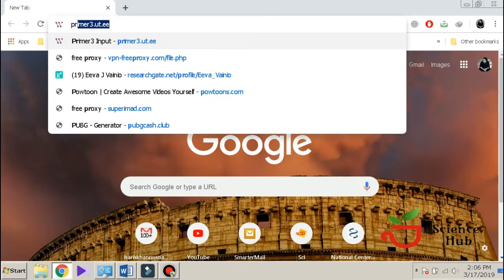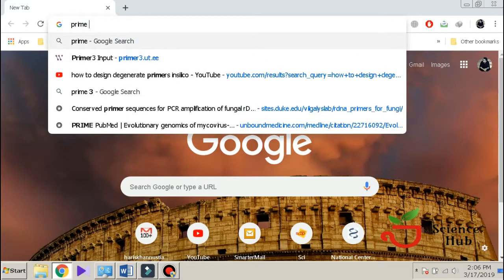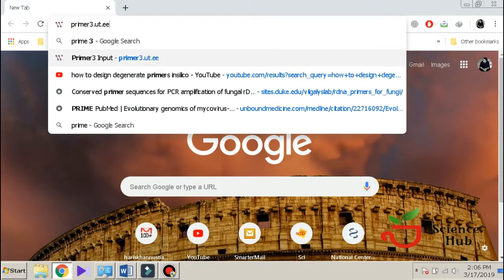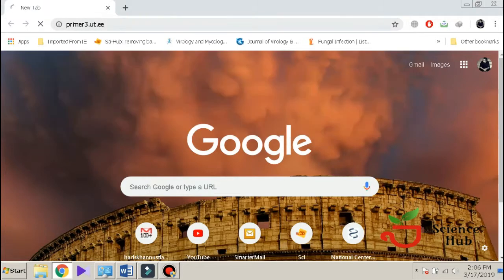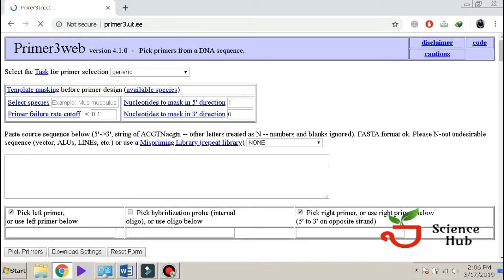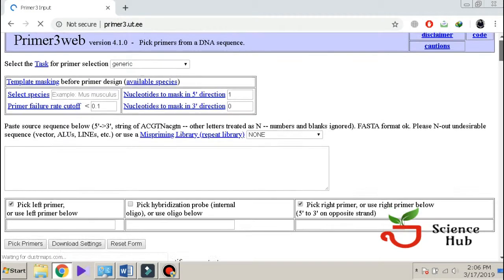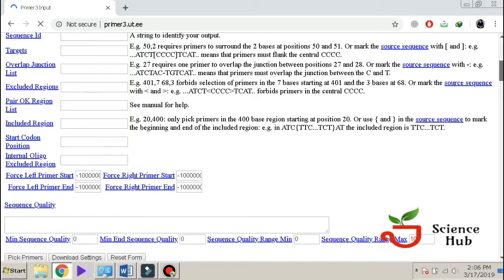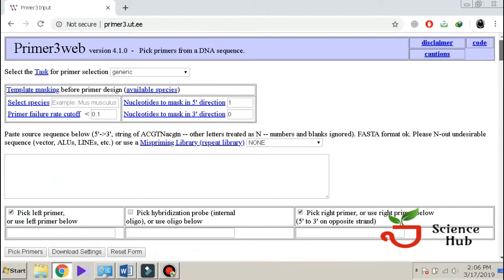Today we are going to learn how to make primers using Primer3 software. For that purpose, we will go to the site of Primer3 in our browser. This is the welcome page of the Primer3 web online software.